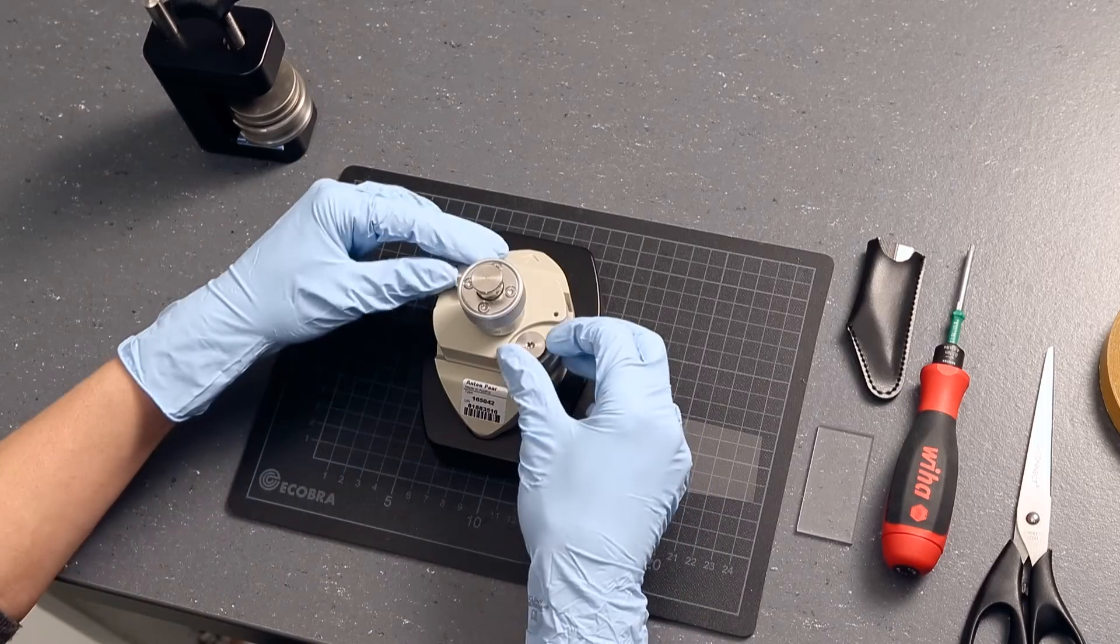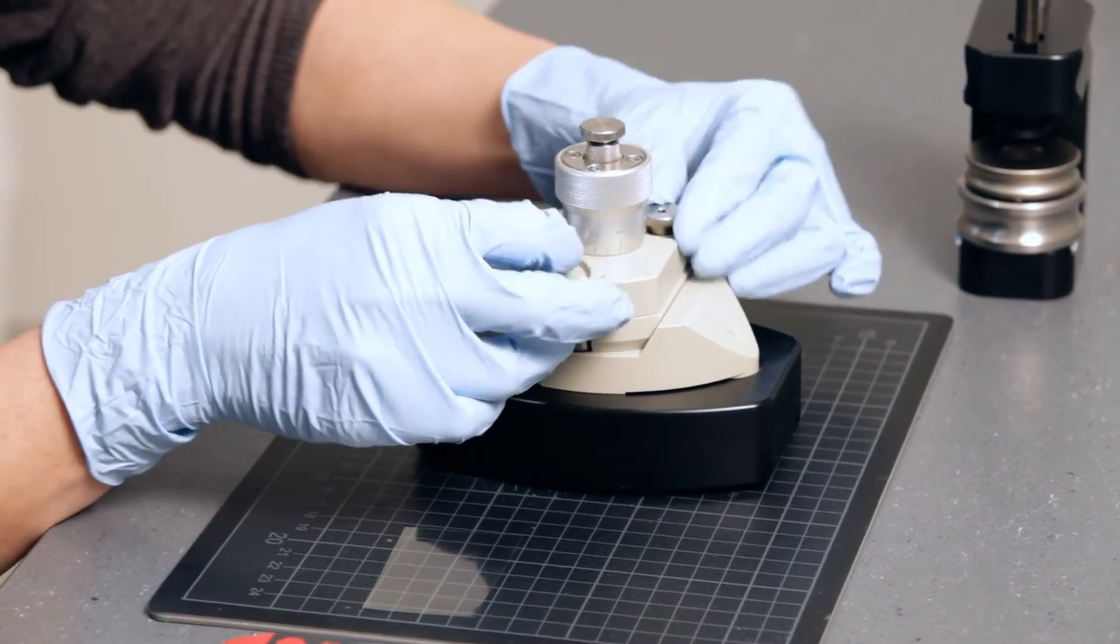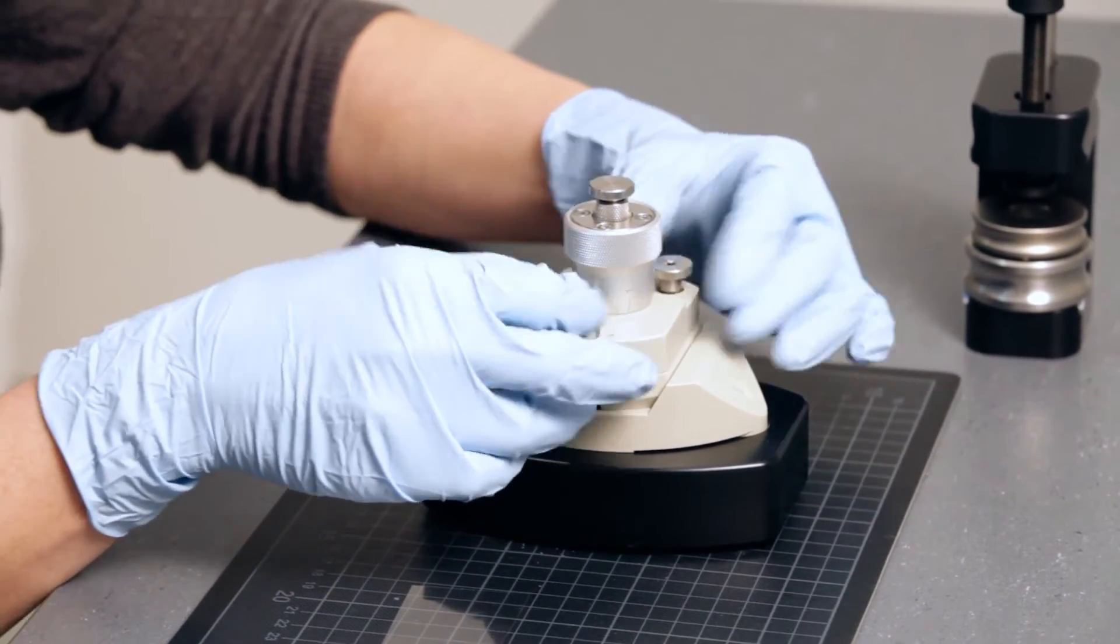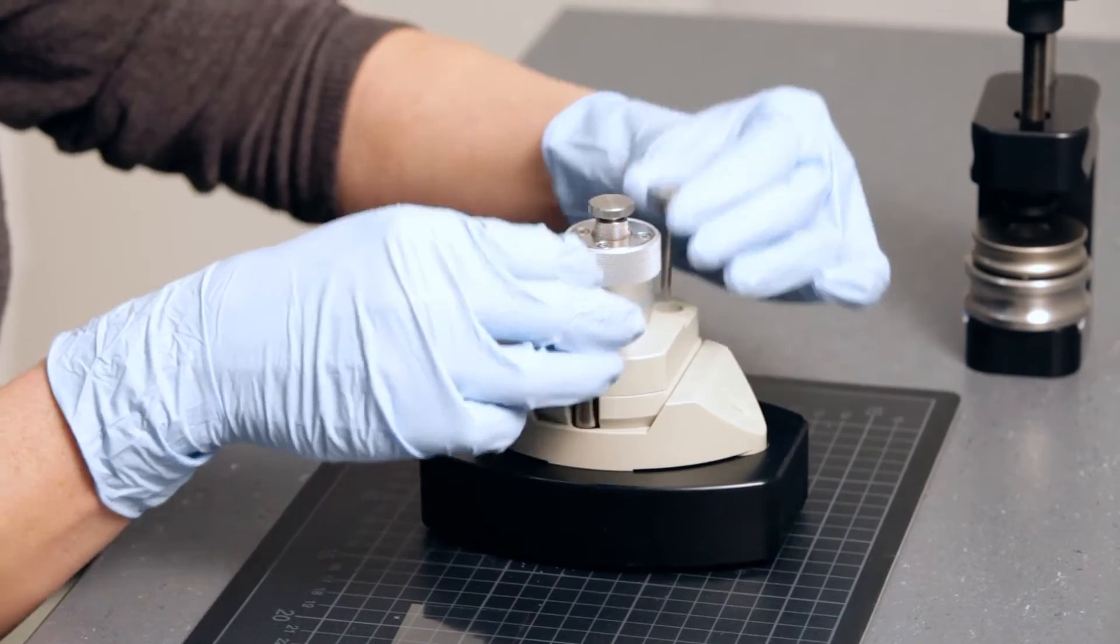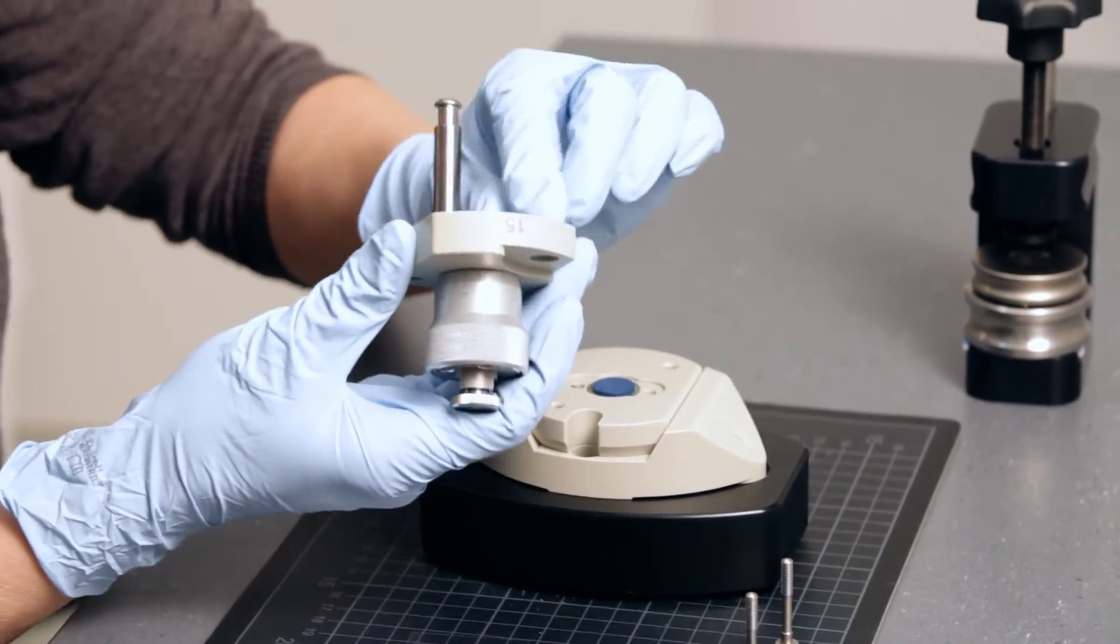First, you need to disassemble the cell. Remove the two screws to open the measuring cell. Secure the spacer gasket.